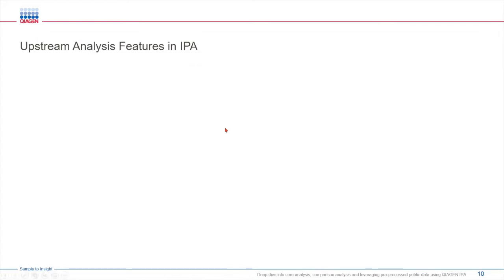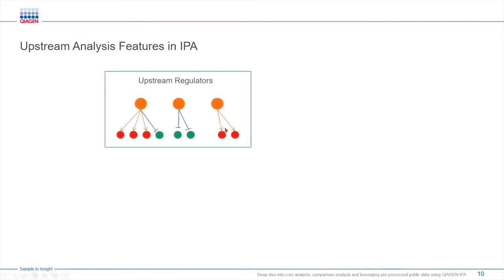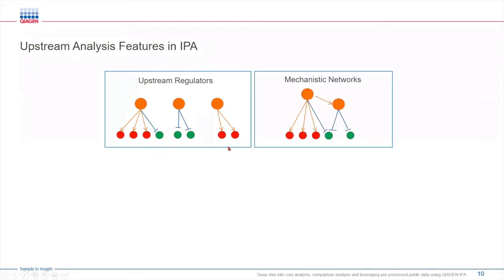Using the upstream analysis tab you can identify individual upstream regulators that can explain the changes observed in the expression of genes within your data set. With the mechanistic networks you can interpret deeper insights into how one upstream regulator interact with another upstream regulator and in turn influencing the downstream targets.